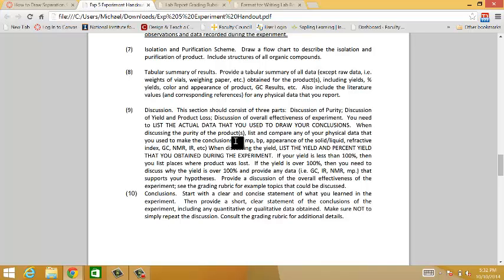My melting point was 50 to 51 degrees, and the literature melting point was 51 to 52 degrees. Therefore, this indicates that the product had good, excellent, outstanding purity. But show the data that you're using to draw your conclusions. This will get tedious, but you really need to do that. Assume that I am only going to read the discussion part of your report. That's what I want to see. I want to be able to see whether the conclusion you're drawing, or that analysis, is correct.